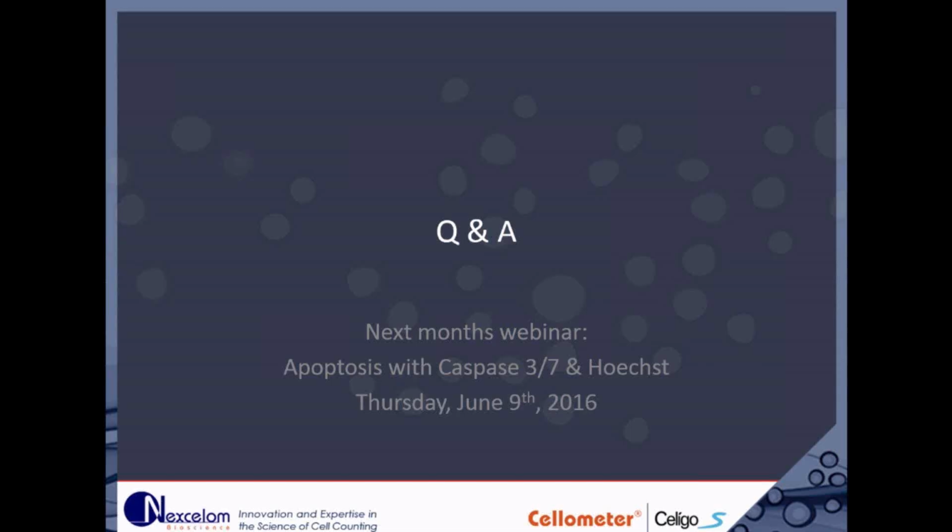Okay. Sarah, just to follow up on that question, haven't we also found that some plates, depending on the brand, the manufacturer, the type of plates, that the actual production or manufacture of the plates makes there some irregularities on those plates, which makes the focus not consistent throughout the entire plate?